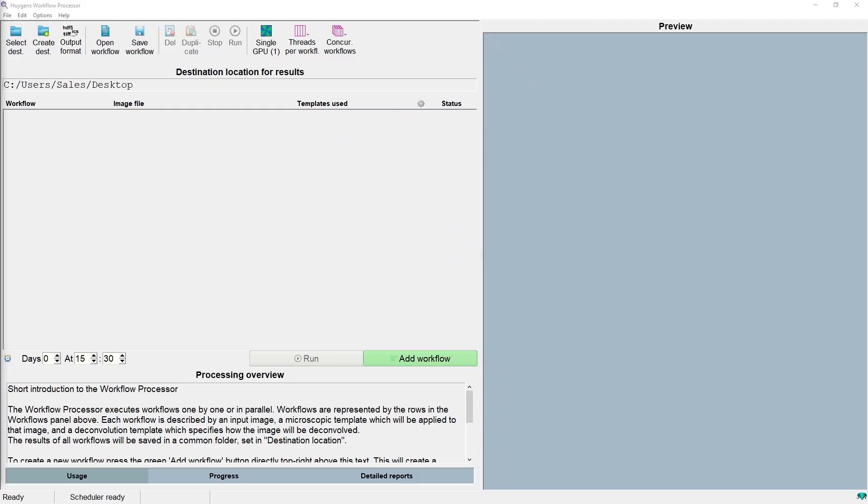This is the workflow processor window. The workflow processor is the tool in Huygens Pro and Essential and Localizer that allows for automation of a lot of processing. In the top we have a row of icons for editing the workflow and changing GPU and concurrency settings. Below that is an area for showing the workflows, and below that is an information area, and on the right is an area for previews.